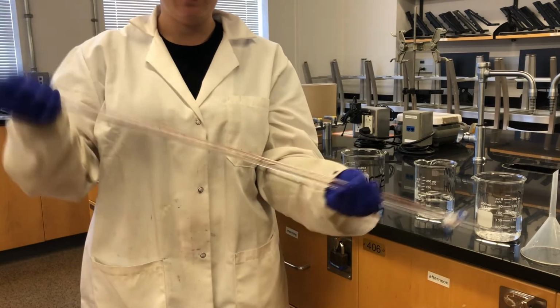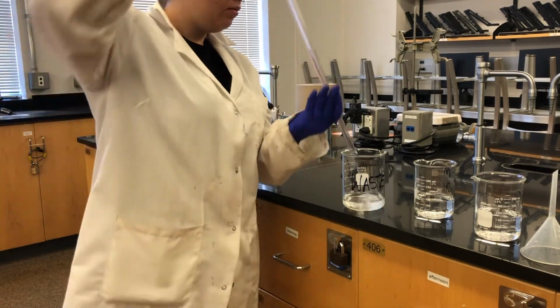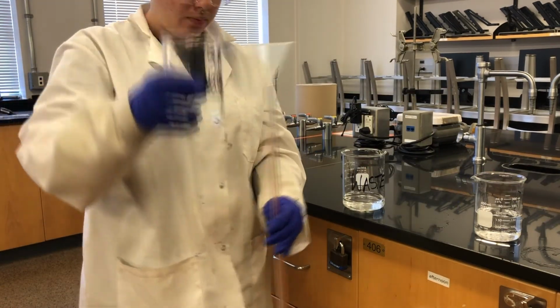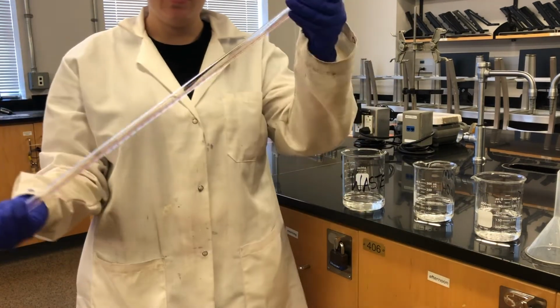To properly condition the burette, we rinse it twice with deionized water, and then twice again with 2 small aliquots of our titrant solution. Conditioning is important to ensure that the titrant solution does not get diluted or contaminated by previous water or reagents inside the burette.